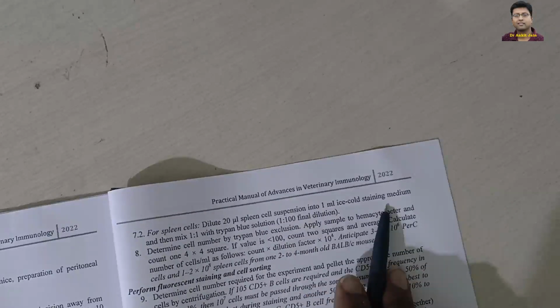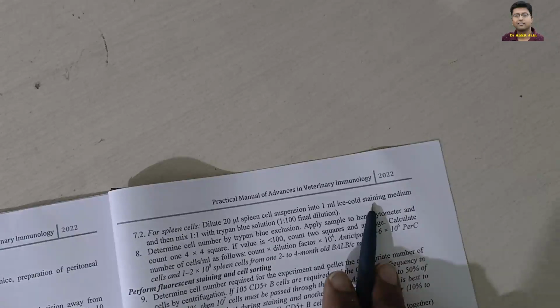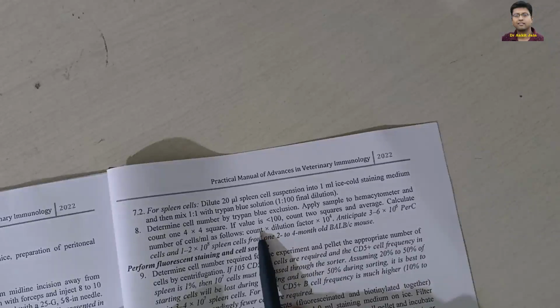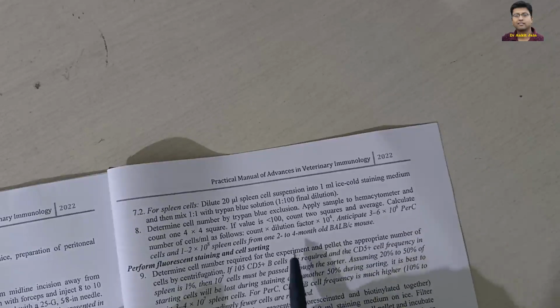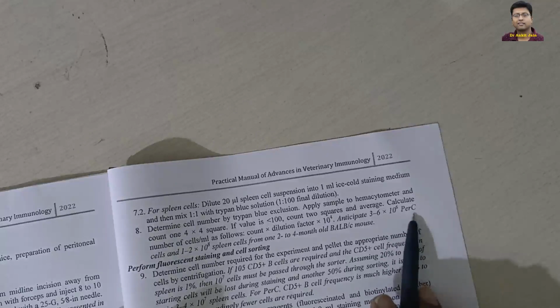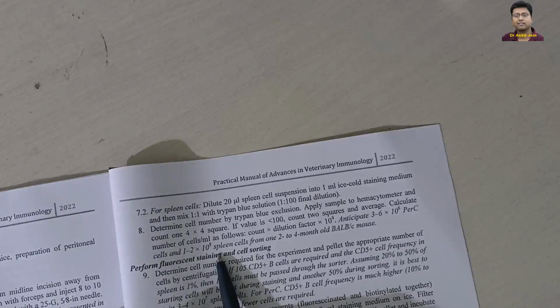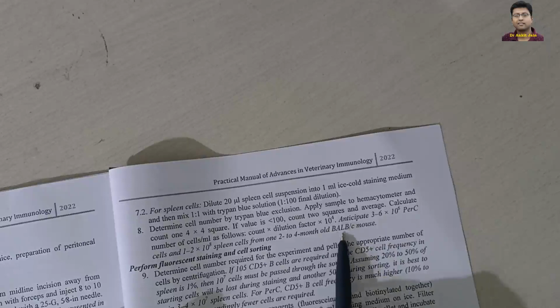So it is under the ice cold staining medium; all the procedures take place in the ice cold staining medium. देन हम विद द हेल्प ऑफ ट्राइपेन ब्लू एक्सक्लूजन मेथड से जो सेल कैलकुलेशन करते हैं वो फाइनल होना चाहिए 3 to 6 × 10⁶ पेरिटोनियल सेल्स। And for spleen cells, 1 to 2 × 10⁸ spleen cells should be there from 2 to 4 months old BALB/c mice.